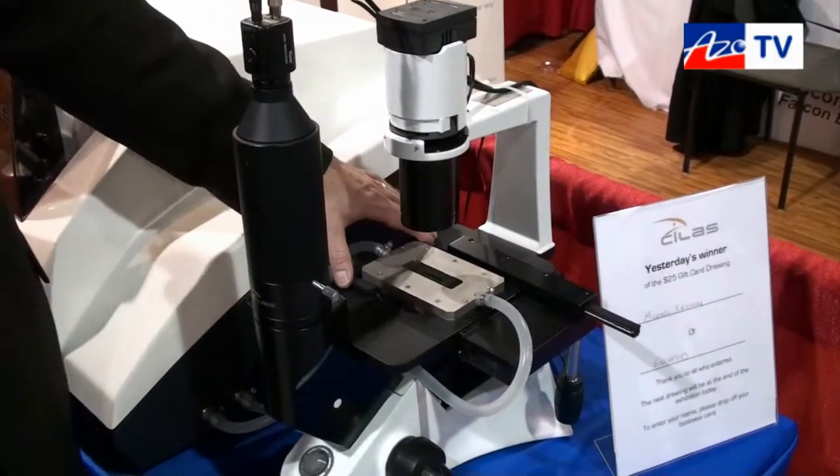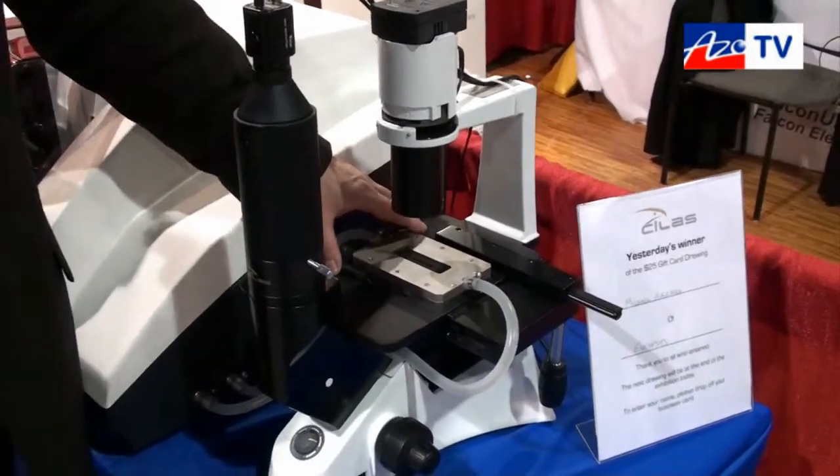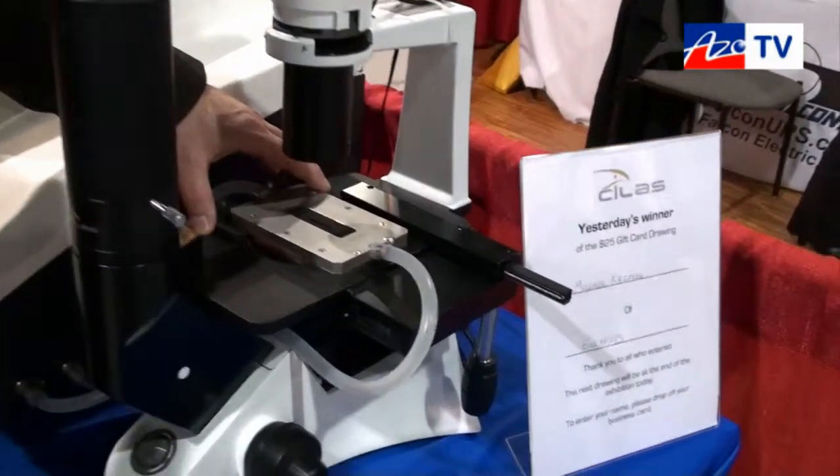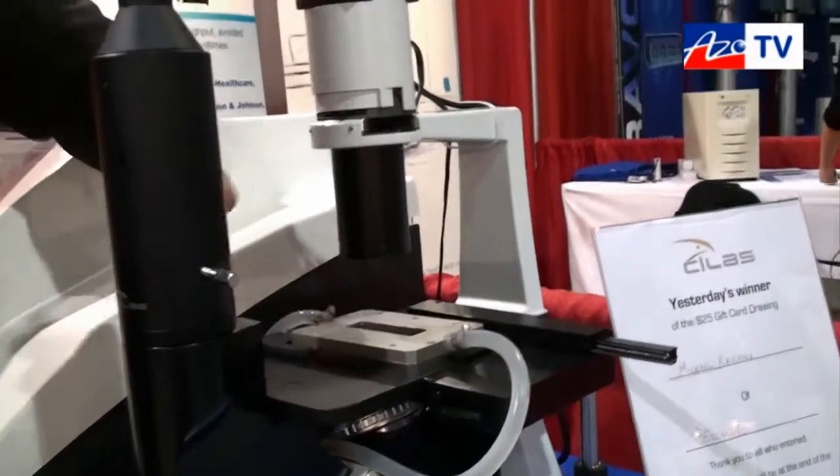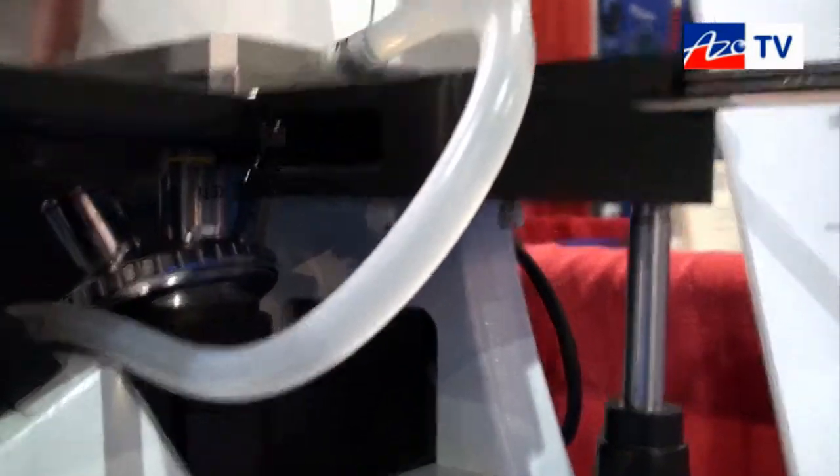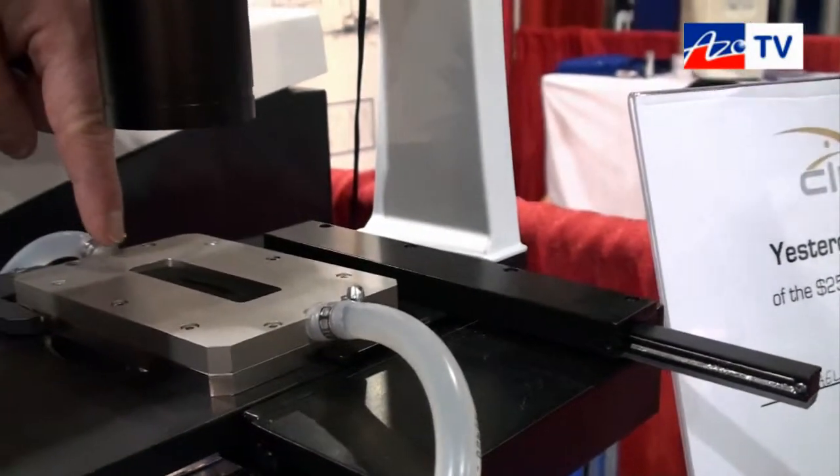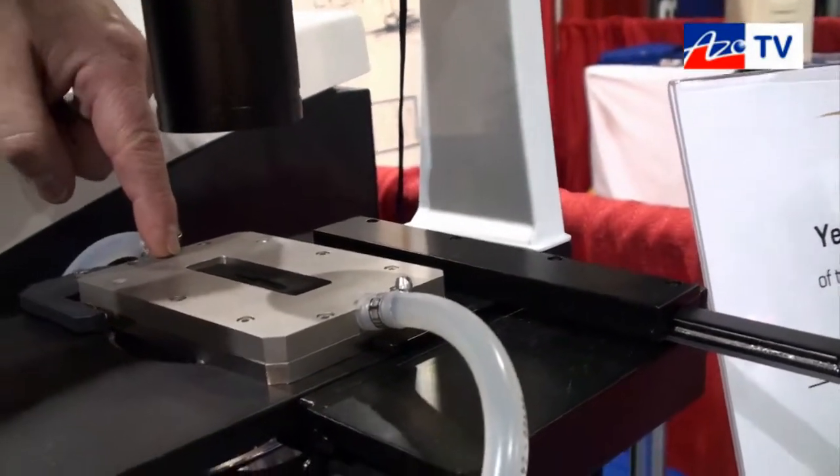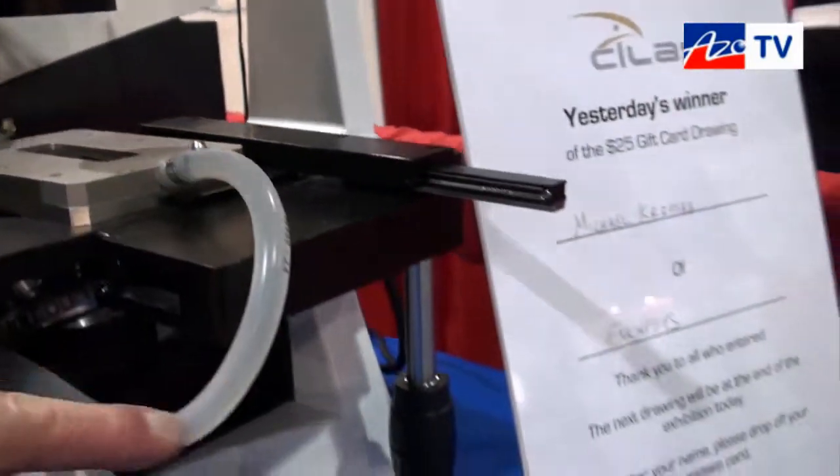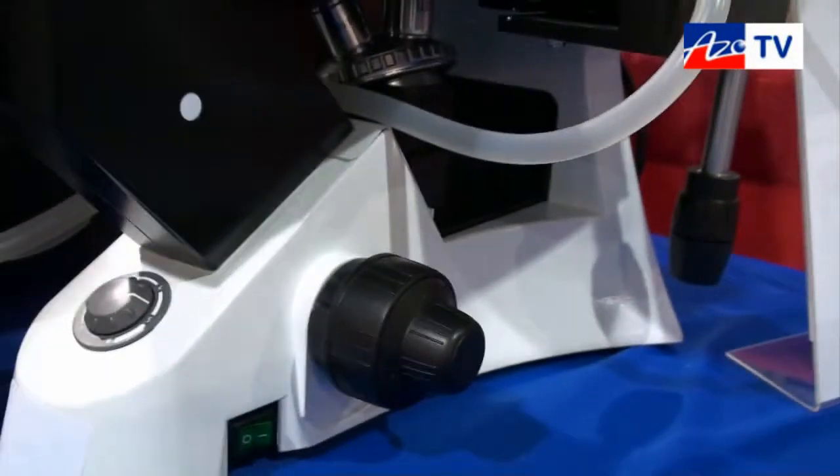The particles themselves, like we showed you earlier, come through the tank through the system itself through the water through the peristaltic pumps into a flow cell, come out the flow cell and go back into the dispersion again. So it is the exact same aliquot of sample that we've looked at in particle size.